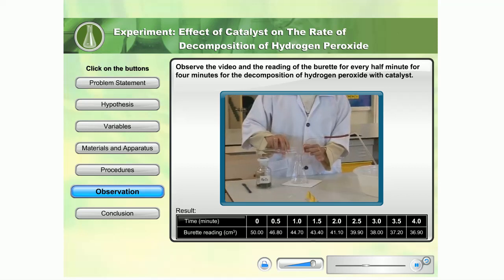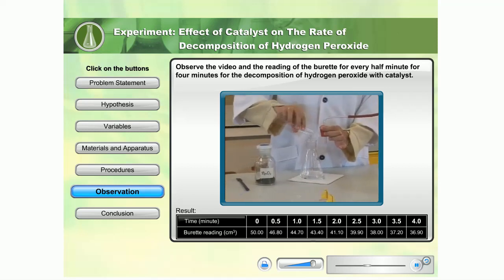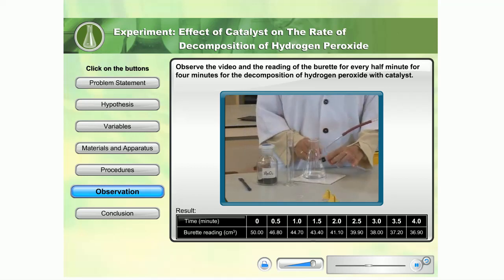Observe the video and the reading of the burette for every half minute for 4 minutes for the decomposition of hydrogen peroxide with catalyst.